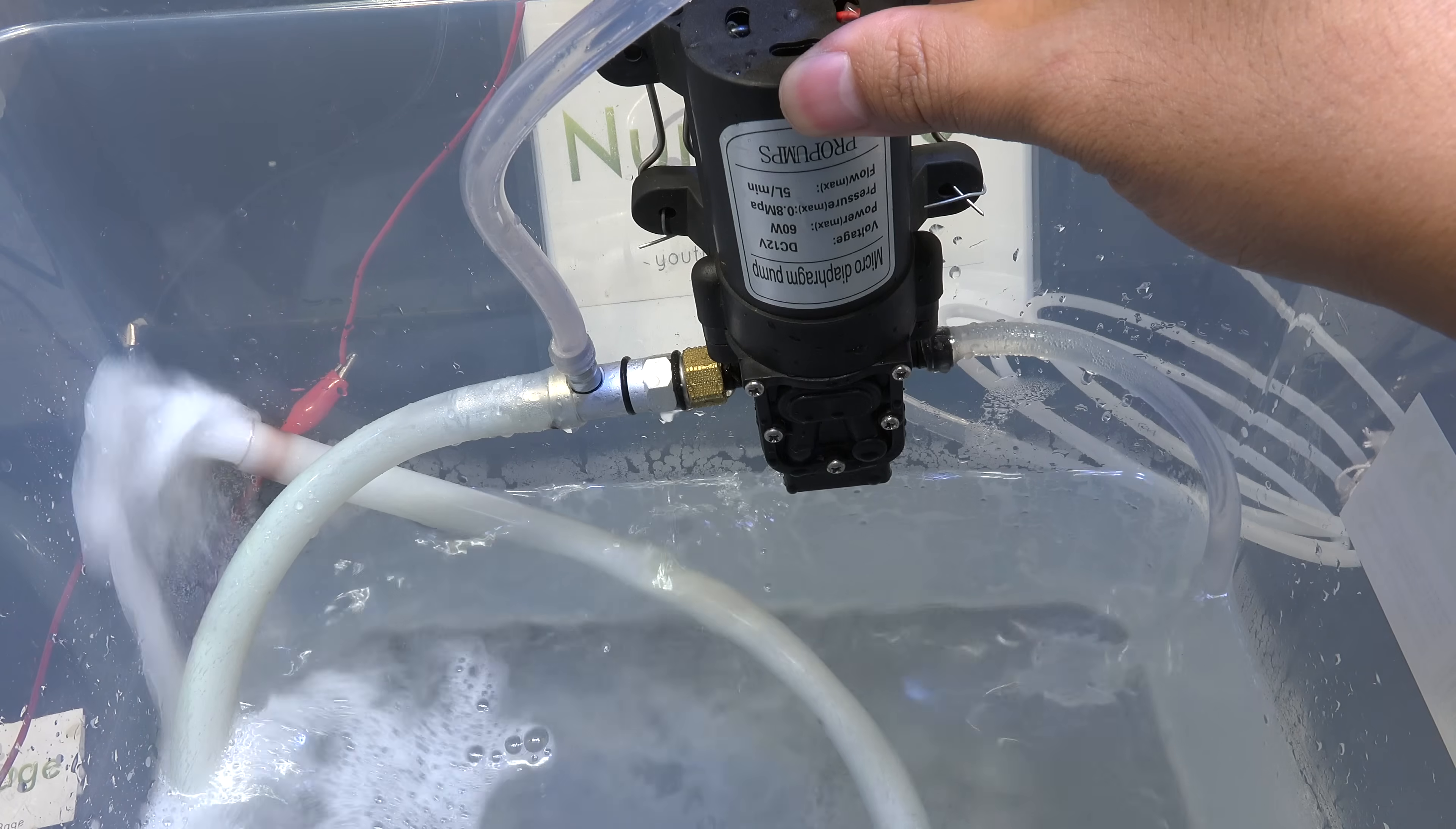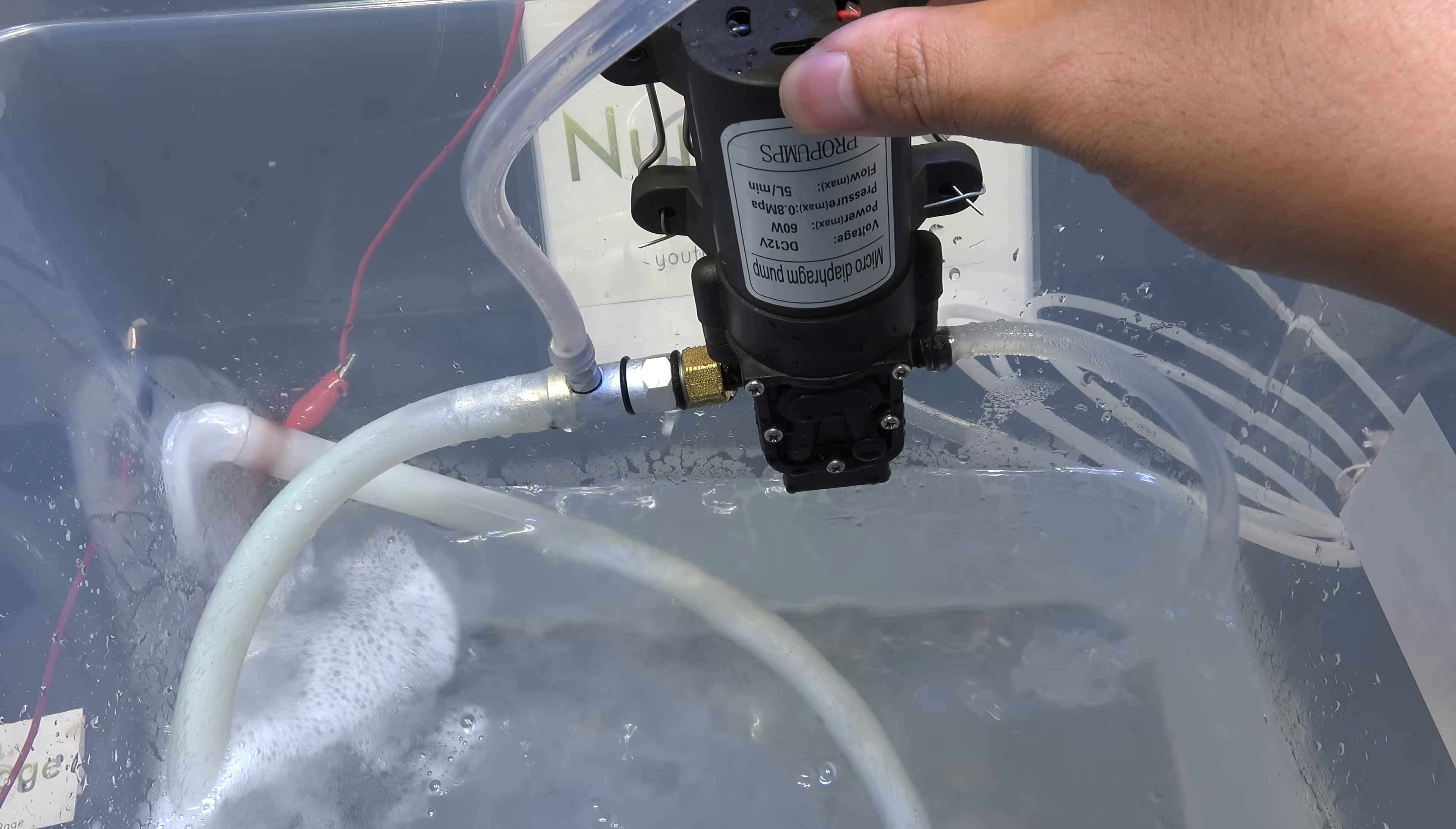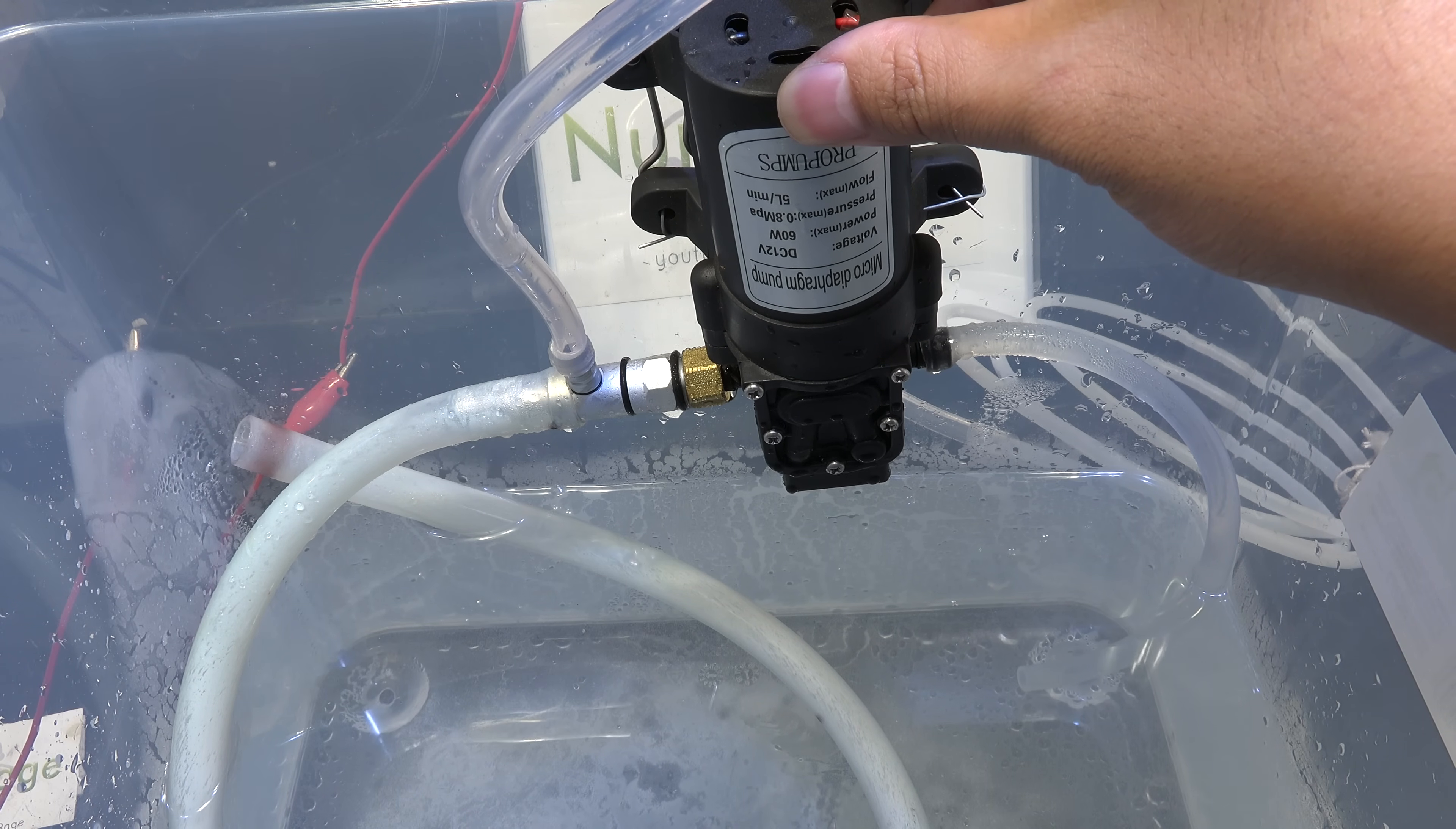The most effective way of getting around this is not to use water at all but to use a fluid with an even lower vapor pressure like mineral oil or ethylene glycol. Ultra low vapor pressure oil called vacuum pump oil can also be used. You can also use a gas and avoid the problem completely. But for that you need a gas compressor with a much higher pressure and flow rate to match the performance of a liquid.